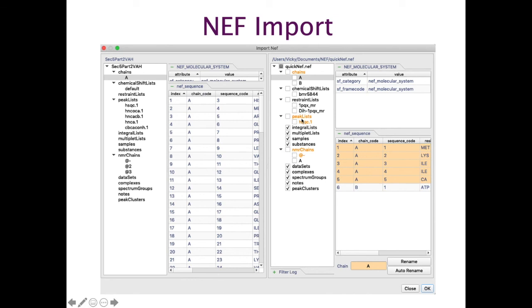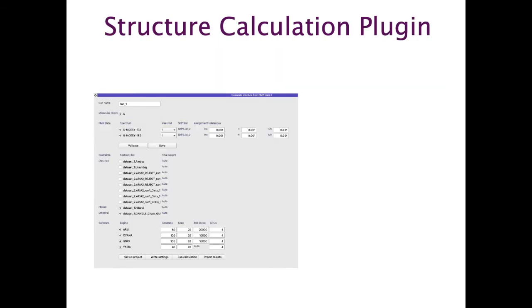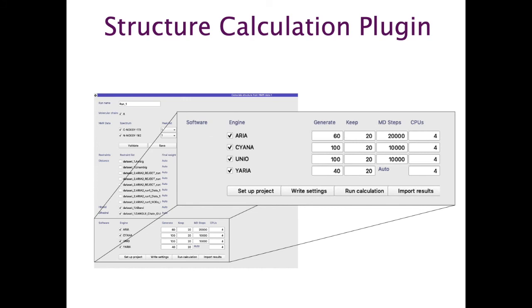And if there are any clashes between names, between what you're importing and what already exists in your current project, then you can simply rename things. Long term, we're probably heading to something a little bit different, where you would have a structure calculation plugin which would allow you to specify a lot of things around your structure calculation within analysis, and then that whole conversion to NEF, the running of the structure calculation and getting the data back via NEF again would actually be rather more under the hood and hidden, and would happen without you being as explicitly aware of it as would be the case initially. So let's have a look at NEF compatibility.